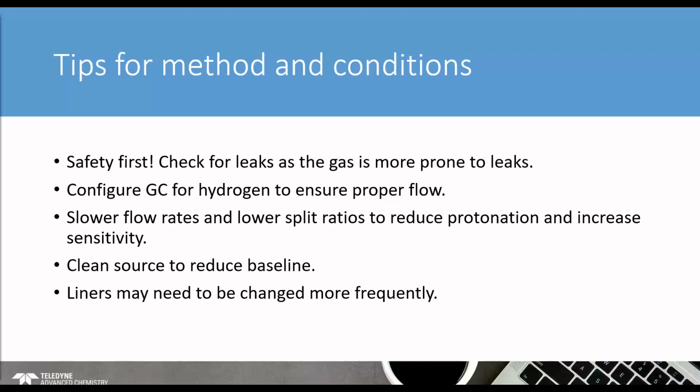Be sure to try slower flow rates and a lower split ratio, as they may help to reduce protonation and increase sensitivity. You may notice that the source will require more frequent cleanings to prevent baseline elevations. The liner may also need to be changed more frequently as well.